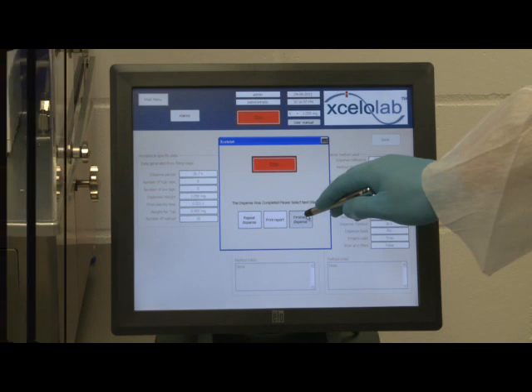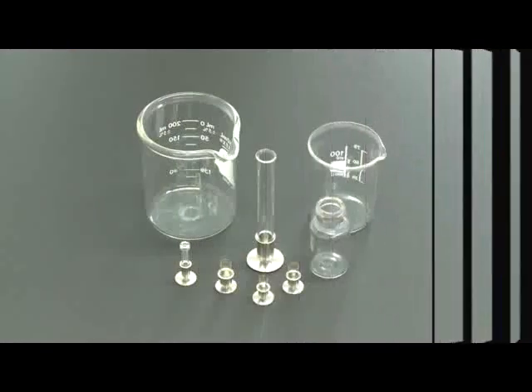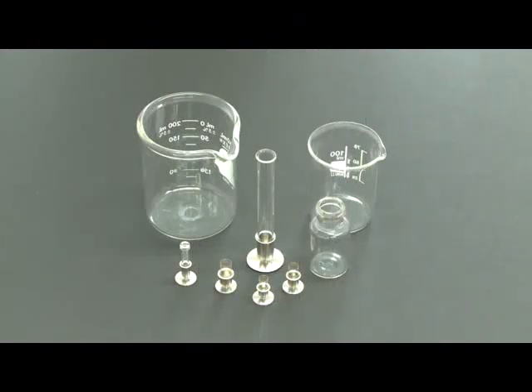The Accelerlab dispenser can dispense into a variety of receptacles. These include capsules ranging from size 9 PC caps capsules for small animal studies to very large capsules, vials, tubes, beakers and flasks. It is possible to fill non-standard, bespoke receptacles; however, a sample would need to be sent together with a technical drawing detailing dimensions, weight and material.